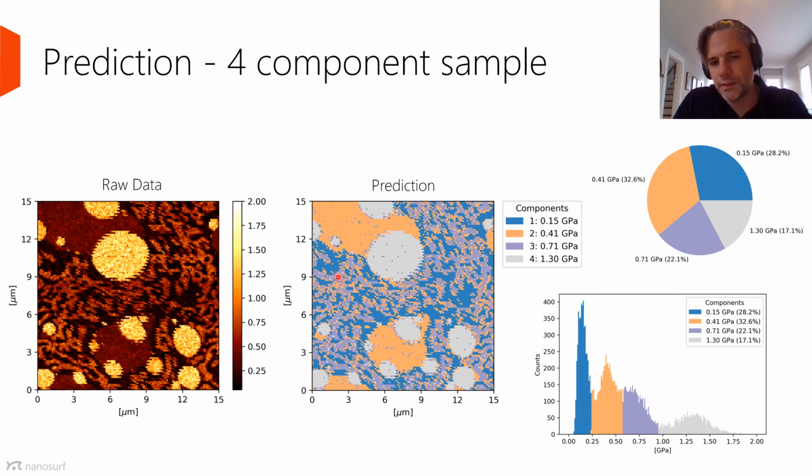The reason is that because it's a mixture, it's going to have the properties of either of these. So this could benefit from adding this mixture coefficient to this sample and trying to see if we can separate this out a little bit.